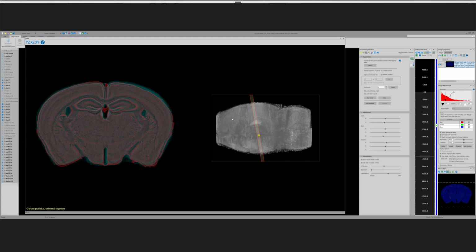What we've done is that this offset has applied or changed the parameters of the plane cut through the Allen space. And I'm just repeating, those parameters are rotations in the X and Y dimensions and Z, but we didn't deal too much with Z, and also shifting the section in the X, Y, and Z planes.